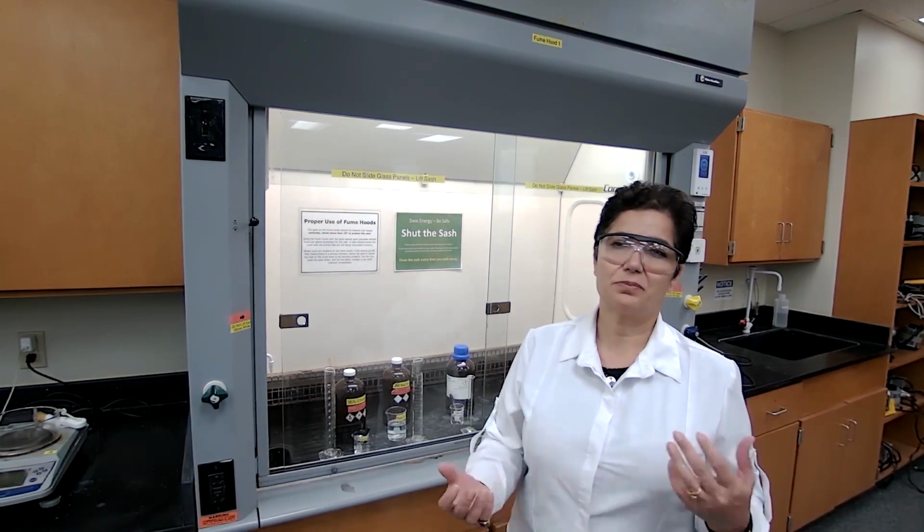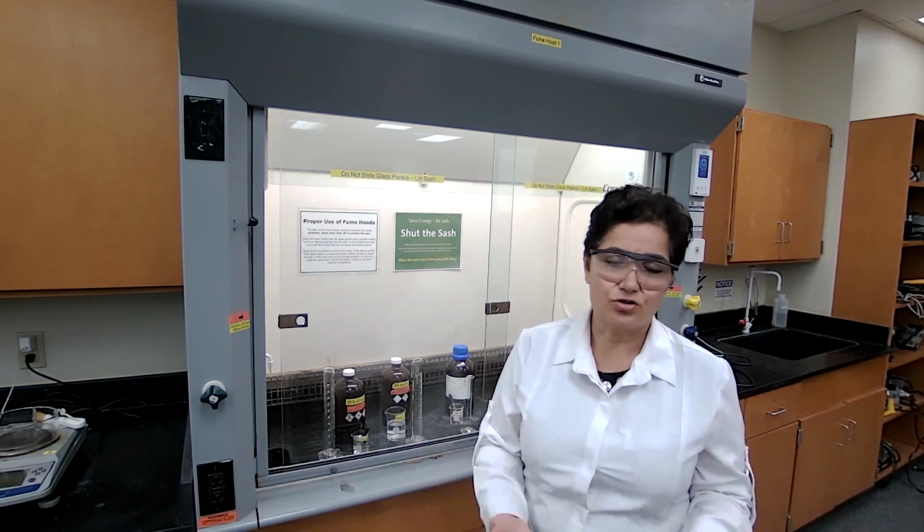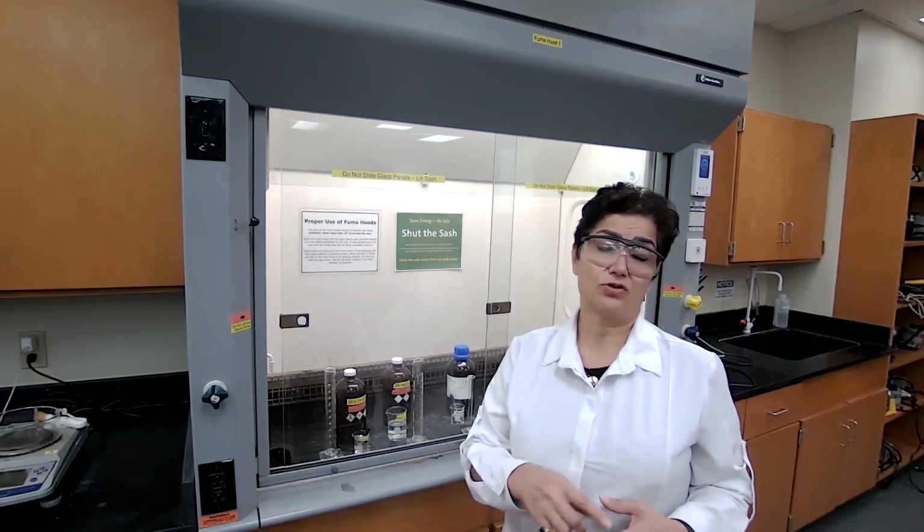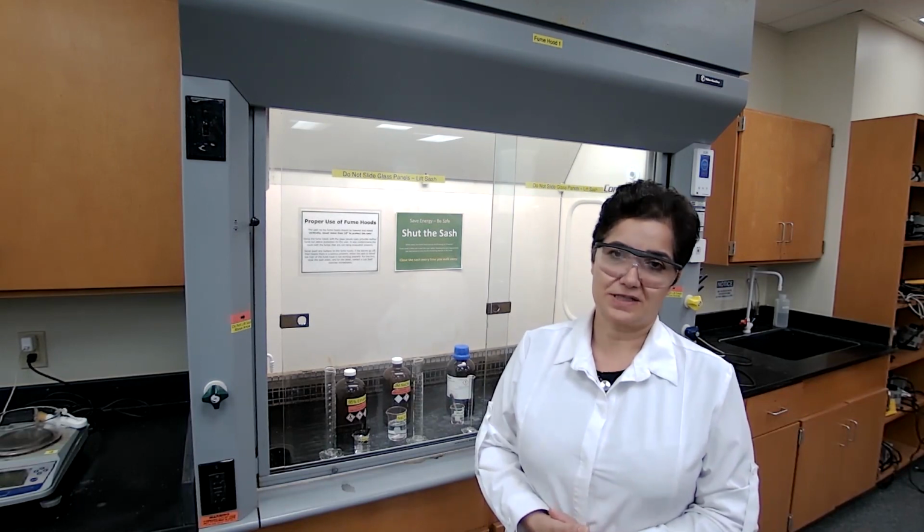It is a reaction between a ketone and an aldehyde in a basic solution. We chose acetone as our ketone to react with benzaldehyde. Acetone has alpha hydrogens, but benzaldehyde doesn't have any alpha hydrogen, which is a better choice of carbonyl compound, because if both compounds have alpha hydrogen, then we could get two enolate ions. For more information, please watch the pre-lab discussion for this experiment.